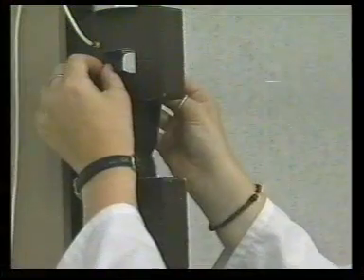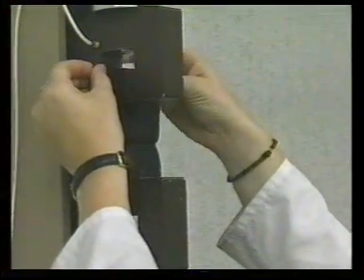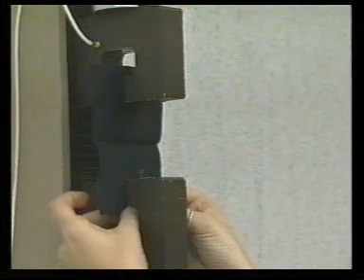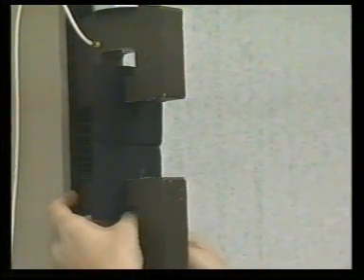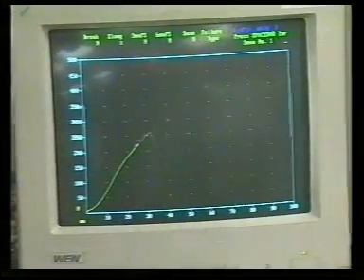An unseamed test specimen is mounted into the top jaw and clamped in position, and then mounted in the bottom jaw and clamped in position, ensuring that the specimen is straight. The start button is depressed and the machine allowed to apply the load until the specimen breaks. The computer will record the data as seam slippage and seam strength.